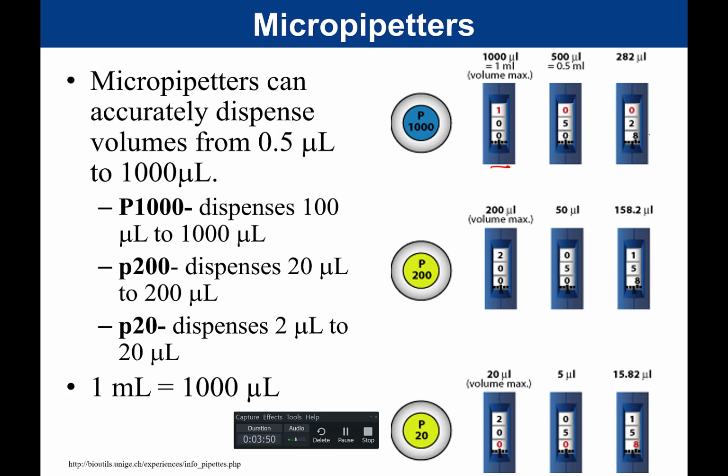So if I want to convert 0.1 milliliters to microliters, I need to take 0.1 milliliters. And we're going to cross cancel. The units I already have need to go on the bottom. The units I'm trying to convert to go on the top because I'm trying to convert from milliliters to microliters. So now I need to plug in my numbers. 1 milliliter is equal to 1,000 microliters, right? That's my conversion.